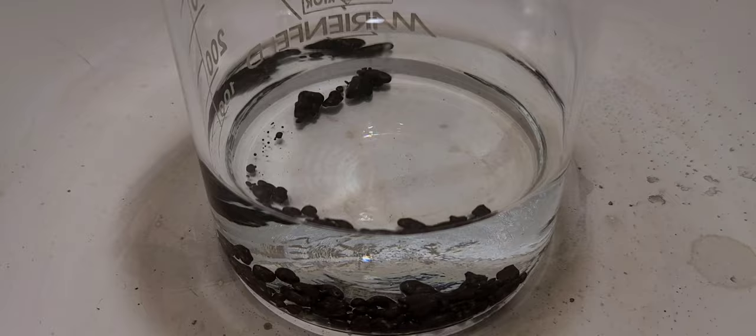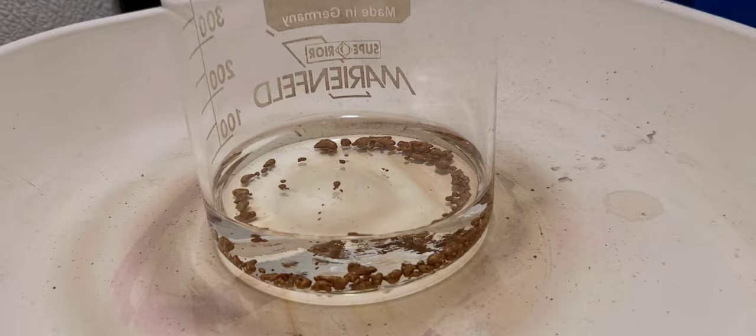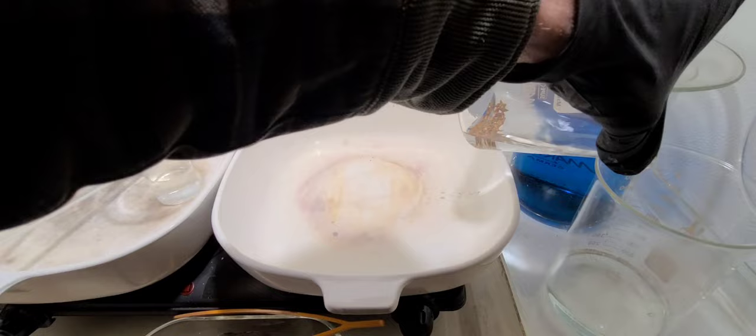I let that cool overnight and it needs to be rehydrated — that's all silver nitrate crystals in there now. So I added some distilled water; it dissolves in water real easy. Now I'm going to rinse that off very well to make sure I get as much of that silver out of there as possible. I really want to get in all the pores of that gold sponge that we're looking at.